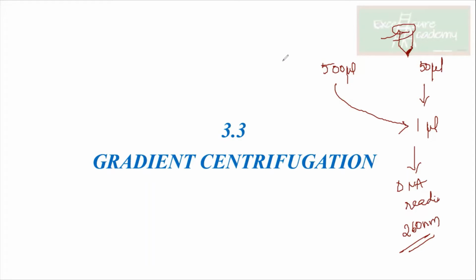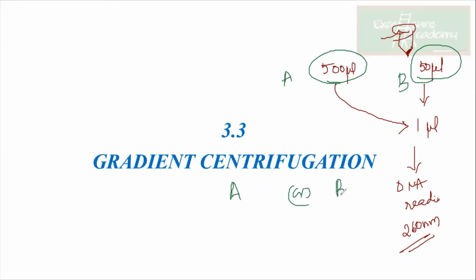अब मुझे ये बताओ, among these two scenarios, let us say that this is A scenario, this is B scenario. Among A or B, which one is going to give me high concentration of DNA as reading? B. Correct. So what is happening when you are adding more buffer? Your DNA concentration is lower. Yes, your DNA is getting diluted, and therefore the reading is affected. So this is how the reading is getting affected. Now see, answer कितना simple था. आप तो बहुत ज़्यादा complicate सोचते हो. इतना नहीं जाना है. So it gets diluted.